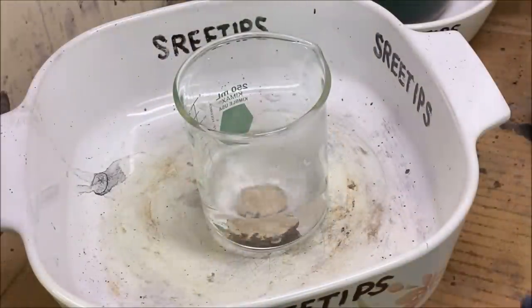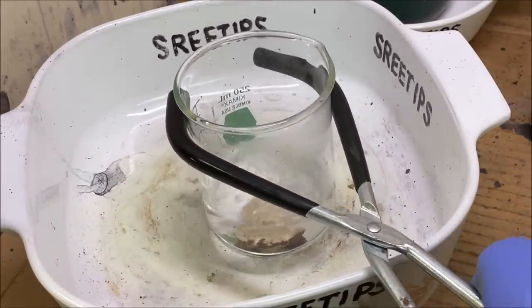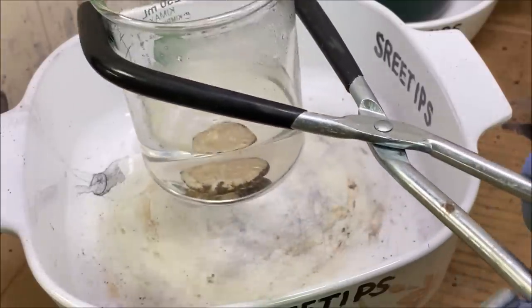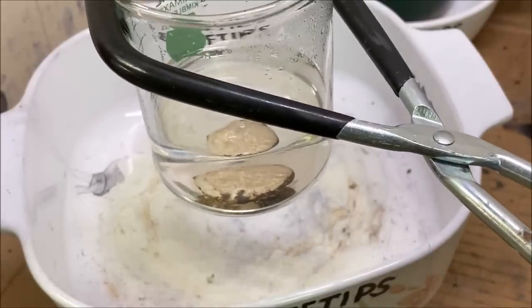This has been boiling in the dilute sulfuric for about 10 minutes or so, 5 minutes. We did that to just get the borax off of there. We'll take it in and rinse it off, do some tests, and see what we need to do to proceed with getting the pure gold out of this.